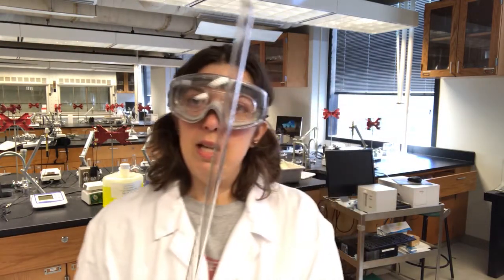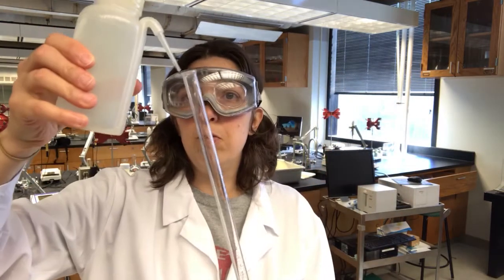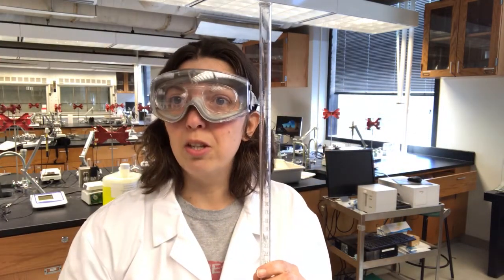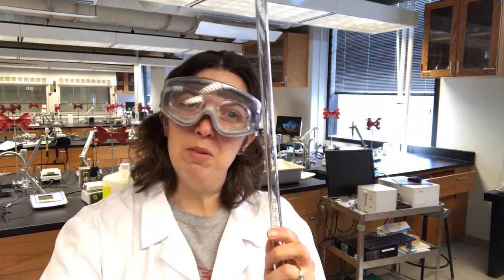And then I'm going to take my burette, use my wash bottle, and just rinse out, making sure that the stopcock is closed. Rinse out into the waste beaker, rinse a few more times into the waste beaker. Easy peasy.